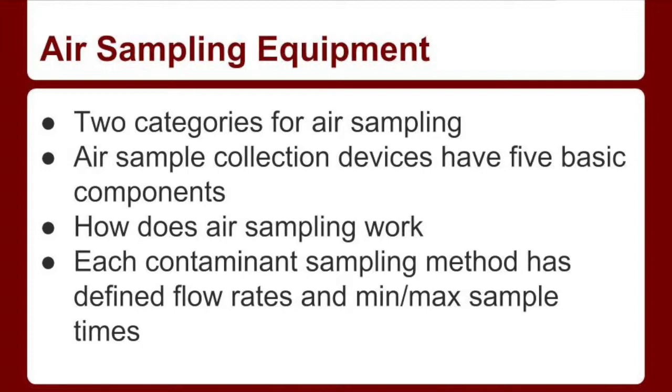Airflows are usually measured in liters per minute or cubic centimeters of air per minute. Most air sampling pumps have built-in flow rate meters to allow the user to visually gauge the approximate flow rate. However, these cannot be used to determine the actual flow rate.